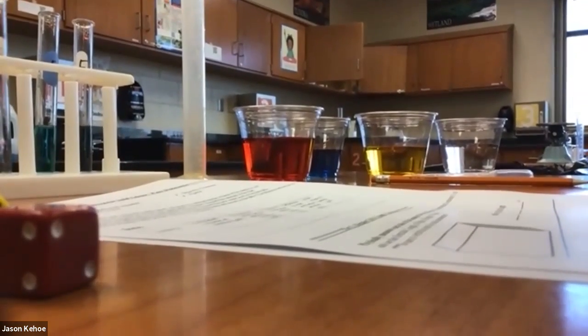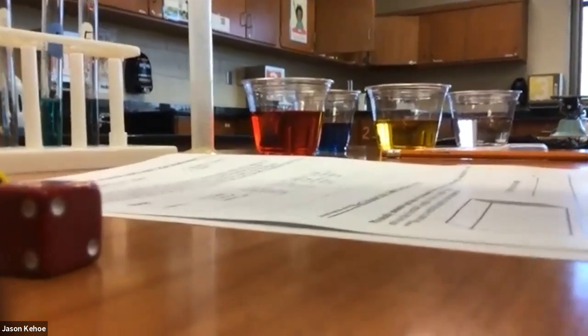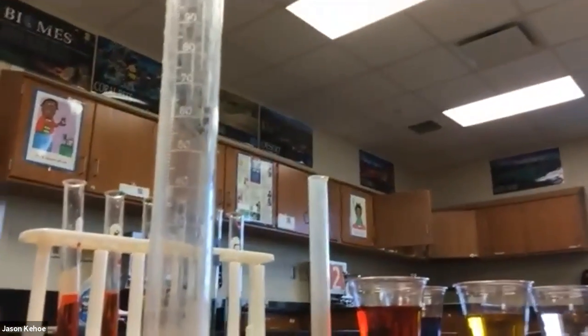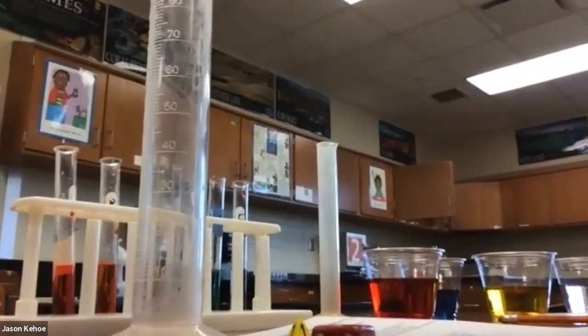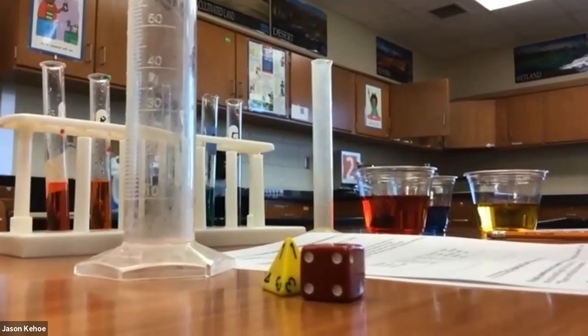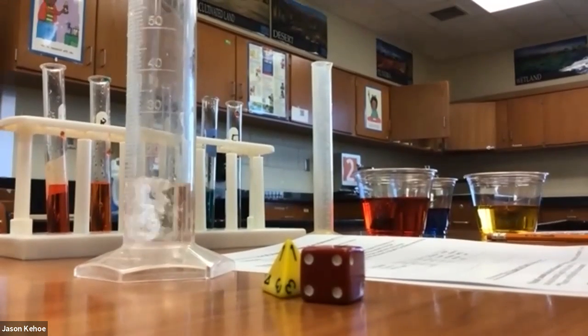Then add 40 milliliters of water to a 100 milliliter graduated cylinder. So here's my 100 milliliter graduated cylinder. There's the 40. Got some water.